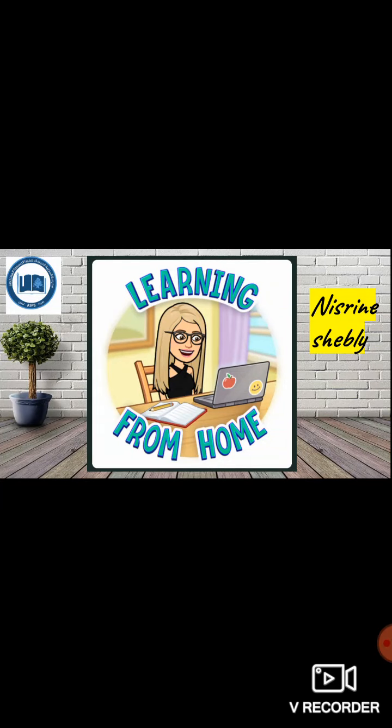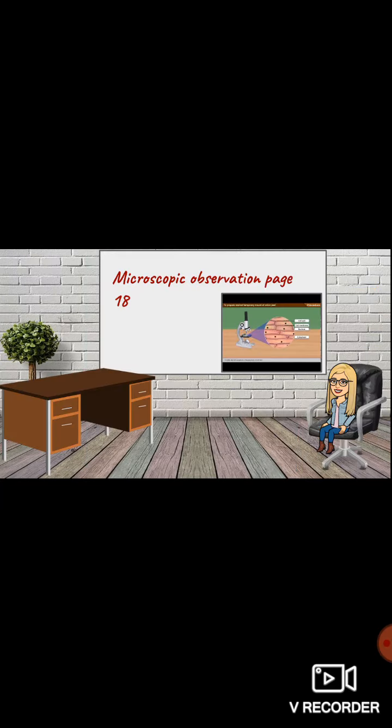Hello everyone, our lesson today is the microscopic observation. How to prepare a microscopic observation in order to observe the onion cell?